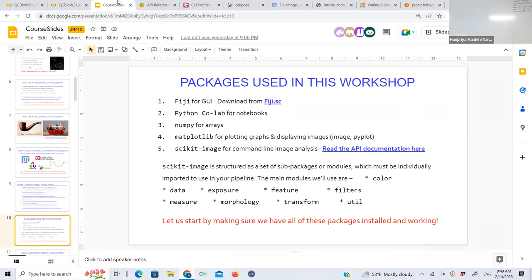You talk a lot about cells, but tissue analysis would be the same, right? Yeah, so tissue analysis is often the same. There are going to be some specialized cases, of course, because the spatial component becomes much, much more important. But many of the pipelines that we use do give you spatial data as well. And unless you have very thick tissues, if you have thin slices, then it's pretty much the same principles.